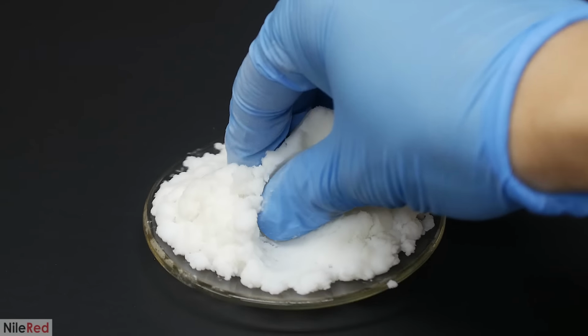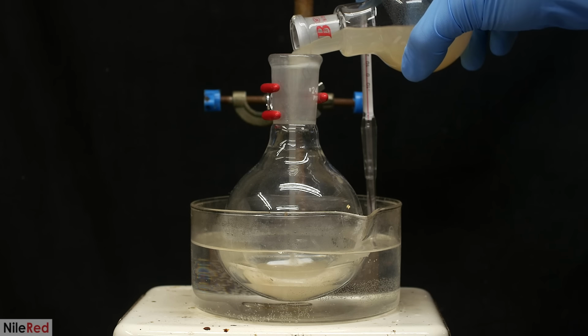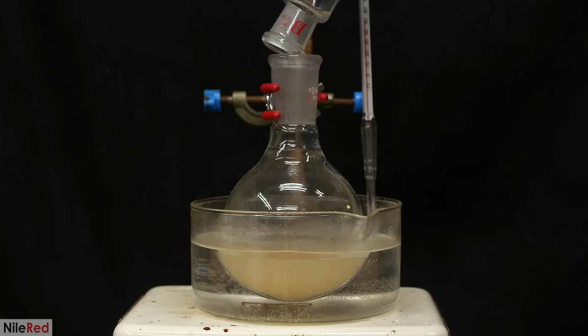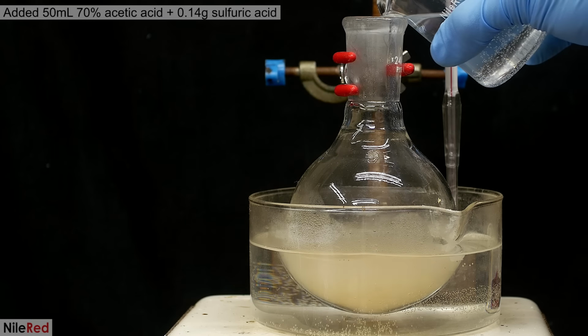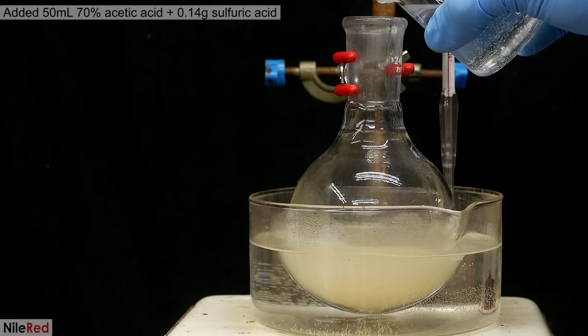of cellulose acetate. For this one, I need to add a lot more liquid to it, and I was afraid that it would overflow the small flask. So just to be safe, I transfer to a much larger one, and I also drop in a stir bar. I wait for it to warm up to about 60 C, and then I add a dilute mixture of acetic acid with a small amount of sulfuric acid.